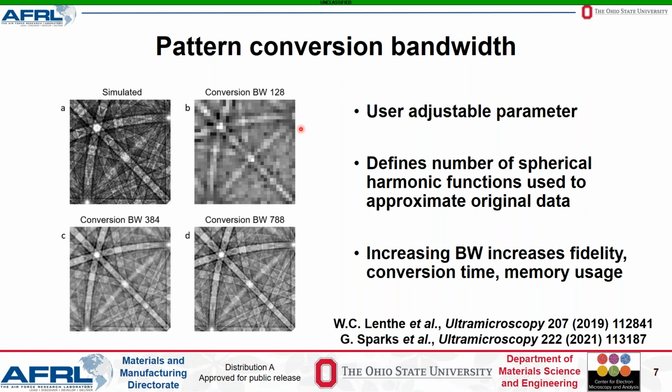All right, thank you. And the next question is, how about magnetic fields distorting the EBSPs? Not sure if that was typed correctly. No, that's EBSPs, yes, electron backscatter patterns. Okay.